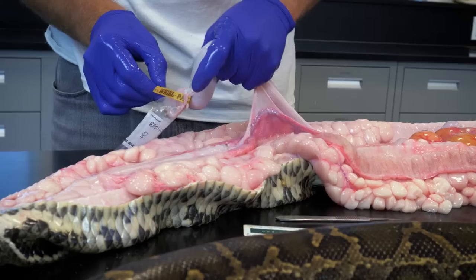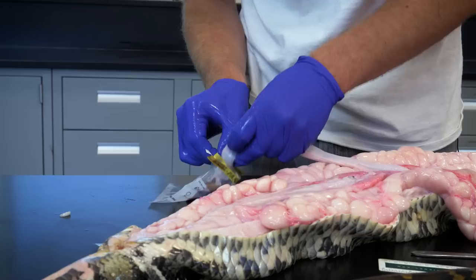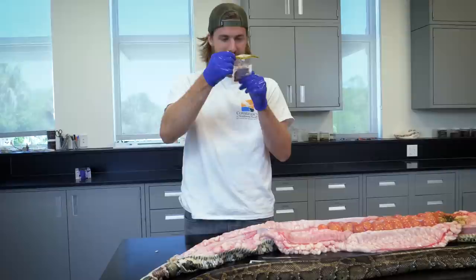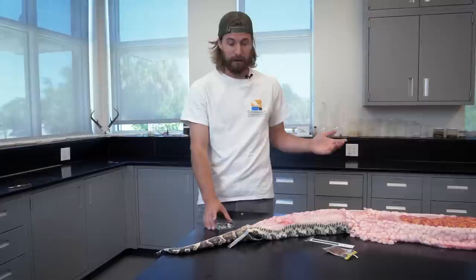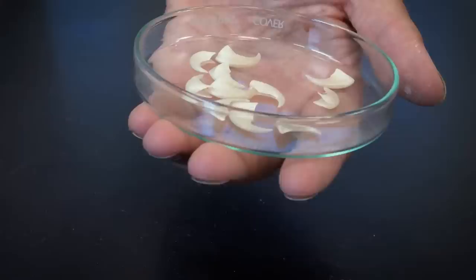From what I can see, it's just unidentified digested material with one or two hairs in there. There wasn't a ton of digested material in this snake, but we have found things in the past that are really interesting — for example, this set of claws. They're actually from a large male bobcat, so we had a python that killed and ate a bobcat.